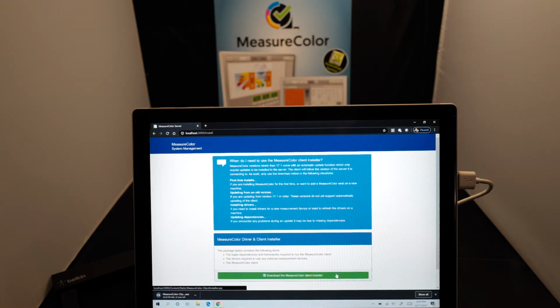your local computer. The file is of some size, so it might take a moment to download, but because it's inside your network, it should not take more than a few minutes at most. This file is so large because it contains all the application software and instrument drivers we require to connect to all the different devices you may want to use.